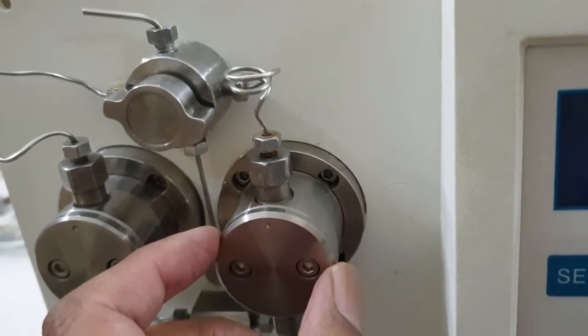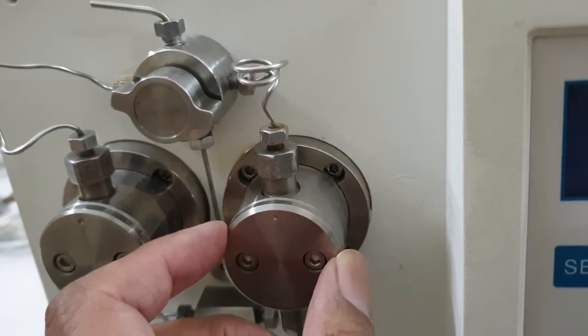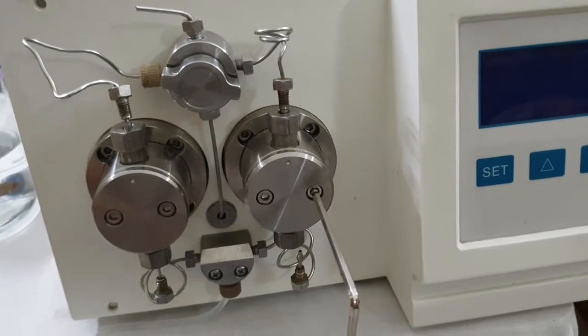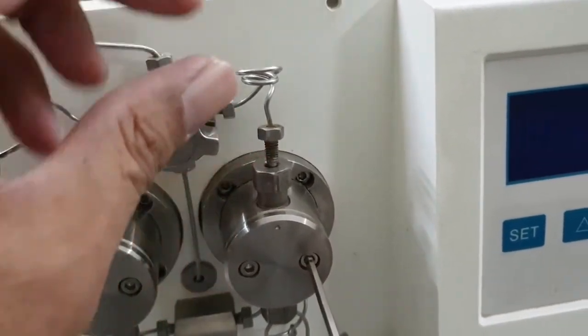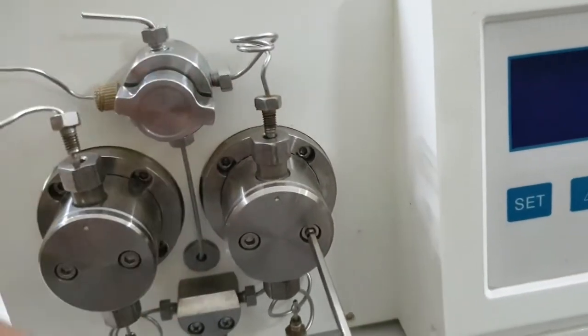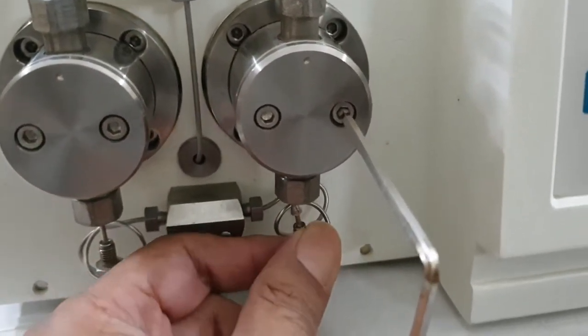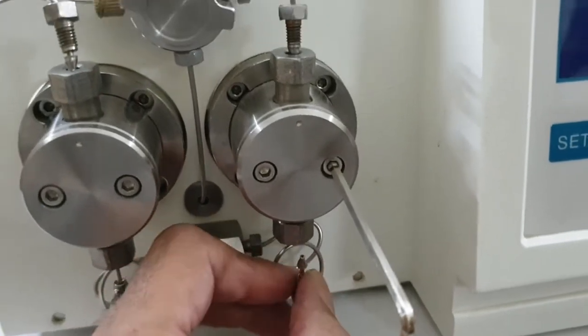This is basically a maintenance part of this HPLC pump after five to seven years. Now we start opening the plunger heads. First of all, we will remove the small lock nut from the inlet check valve using a spanner. I have now removed these two nuts from the outlet check valve and the inlet check valve.